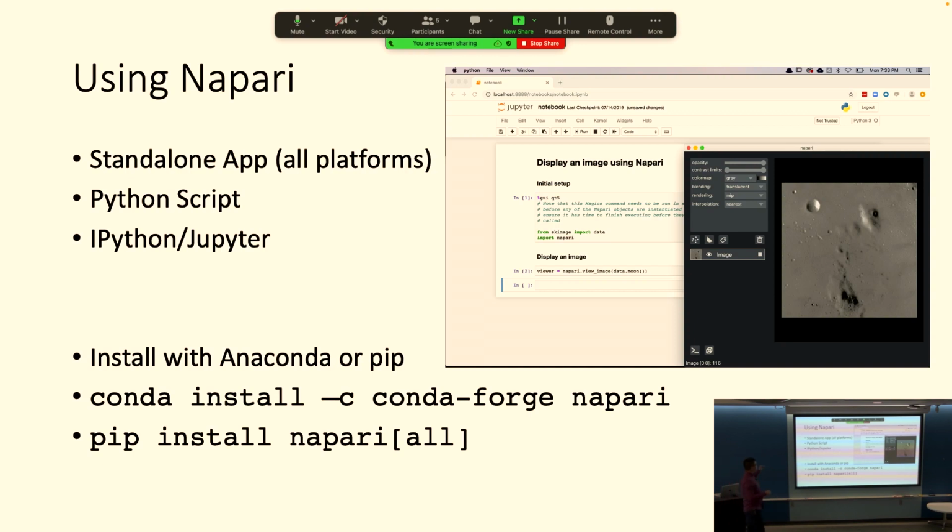All right, okay, so we recommend that you install it with Conda because it depends on the PyQt package, which might sometimes not install, for example, on M1 Max. So in order for maximum compatibility, we recommend that you install it with Conda.